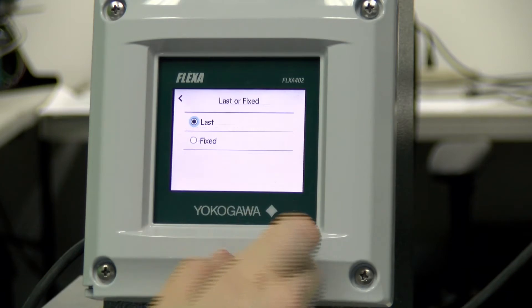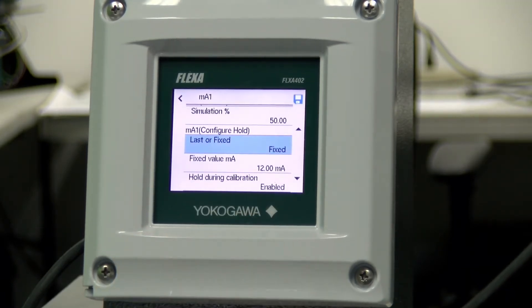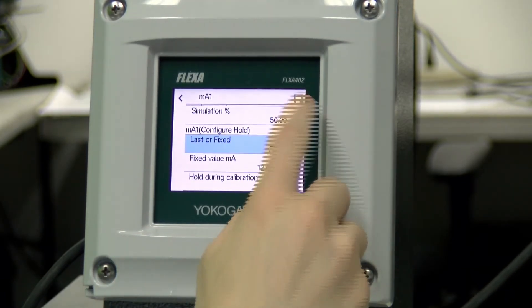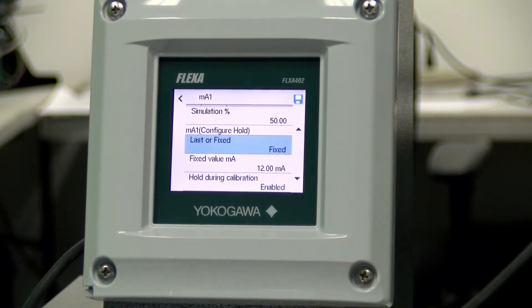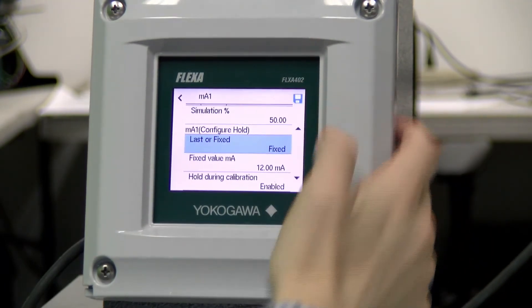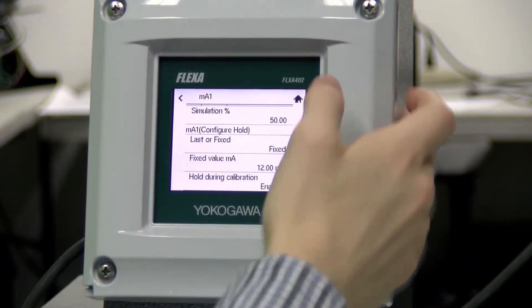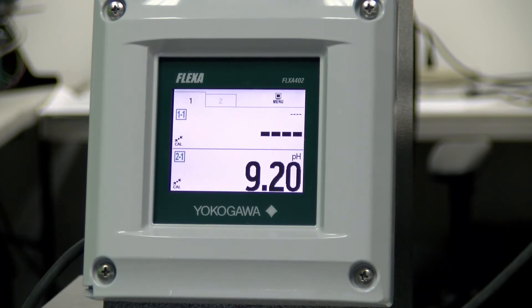And then finally you can enable a hold last value during calibration. Once all of these settings are set — let's say we'd like to fix that value — a save slot will appear in the top right corner. Just click that save slot, then home, and you're done.